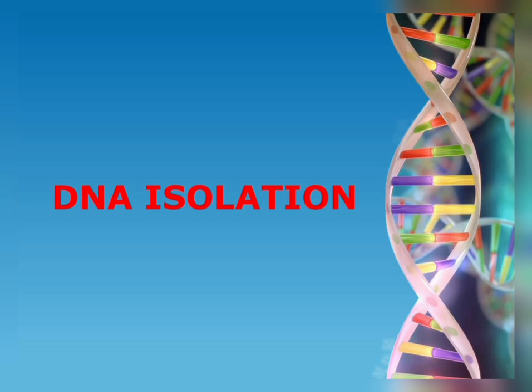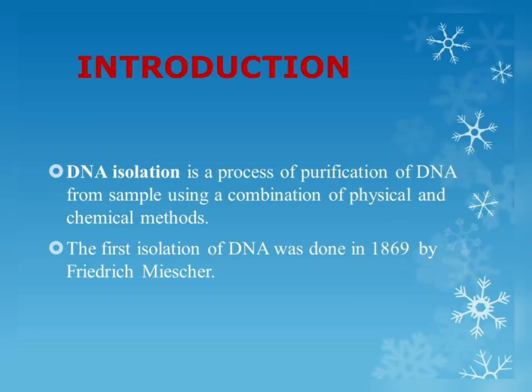So today I am here to explain to you about the isolation of DNA from a given sample. Now, let's come into the introduction.